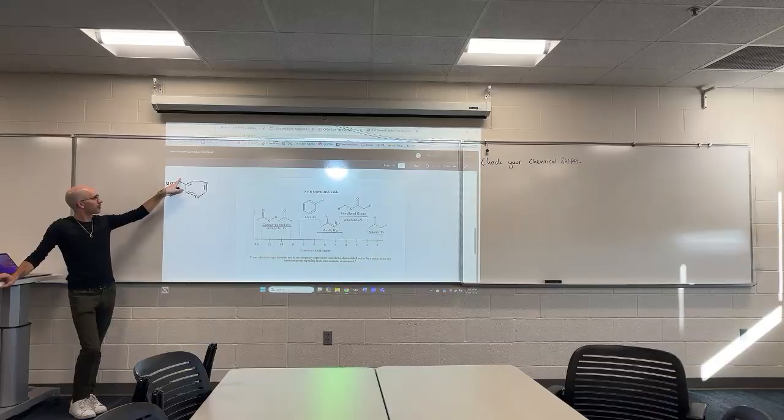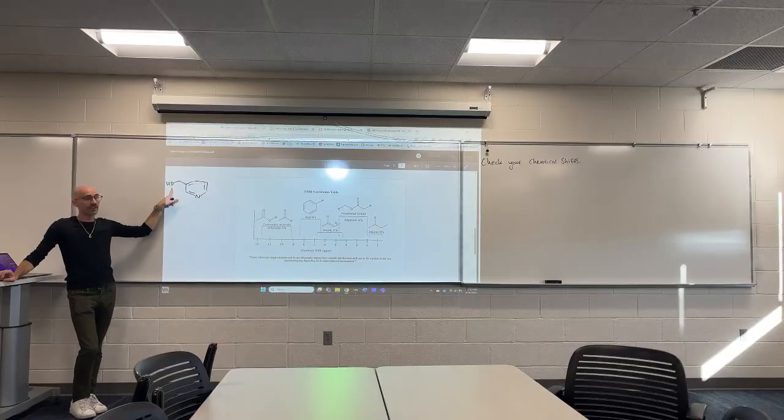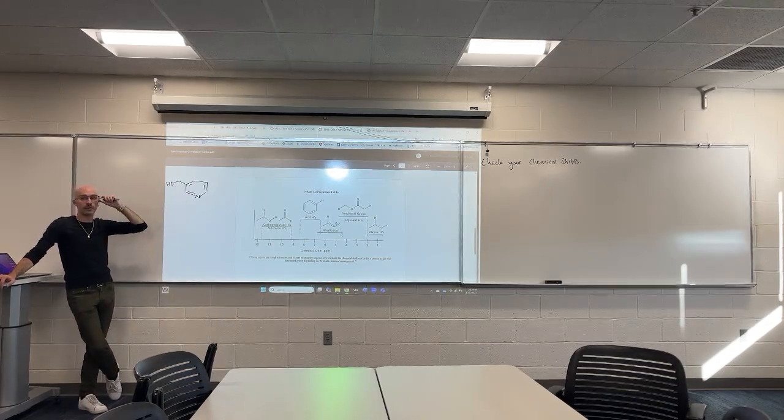Yeah? Two hydrogens on a carbon that is bonded to an alcohol. Is that it? Is that the only functional group it's adjacent to? I heard it. Think. Yeah, it's adjacent to that ring. If this were benzene, that would still be a functional group. It's like a type of benzene, so it's still a type of functional group.